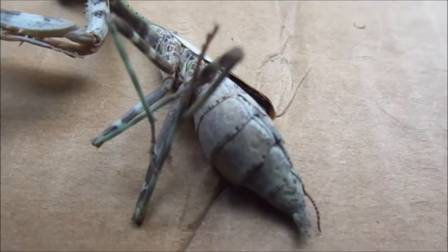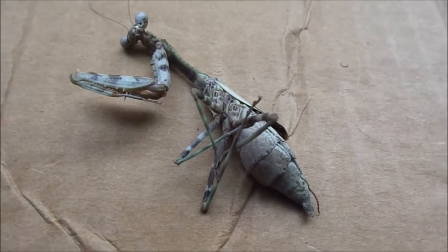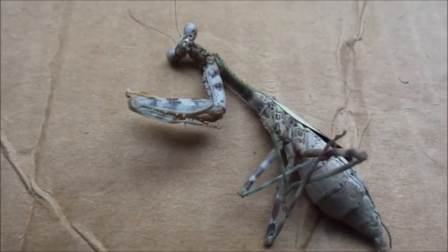You can tell it is a female because it has these six segments down here — one, two, three, four, five, six. I can personally also tell it's a female because it's already laid eggs.